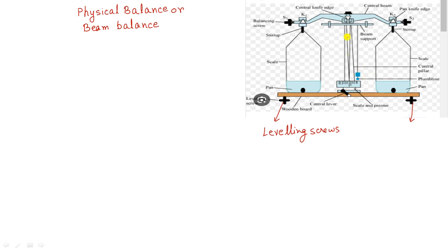Here you see the central pillar, which helps to support the physical balance. There is also a beam support. When you are not measuring the mass of an object, you move the central lever and the beam support will support the physical balance.